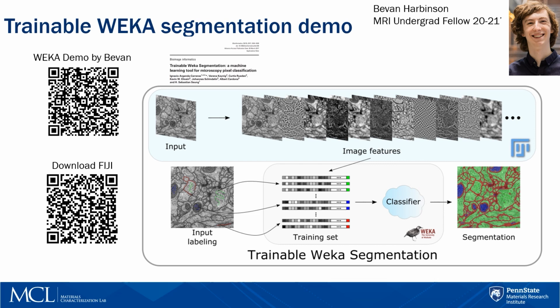This tool, this trainable WEKA segmentation tool, was first brought to my attention by Bevan Harbinson, who was an undergrad fellow in our MRI, Materials Research Institute, undergraduate fellowship program.